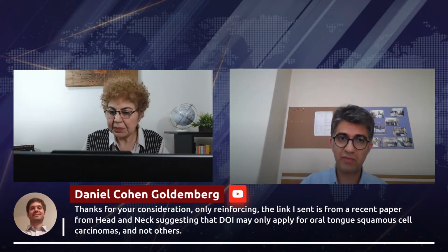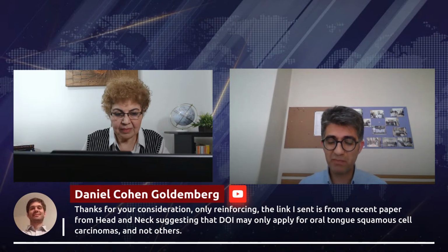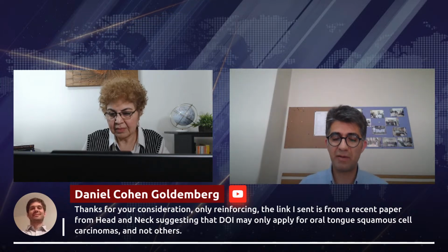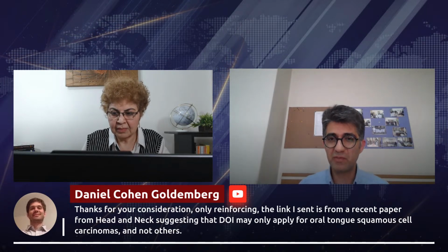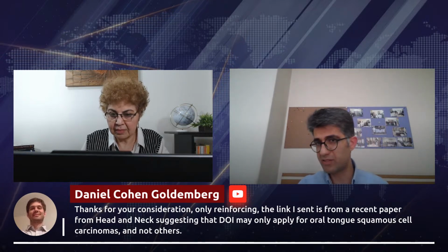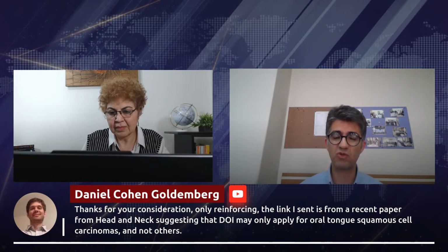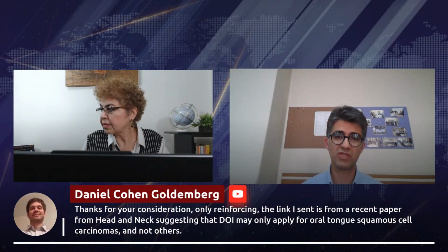I do agree with Dr. Daniel because, as I mentioned, the angulation of the specimen in different parts of the oral cavity may confuse the pathologist, and I can confirm your suggestion that it may be useful and helpful to assess depth of invasion in tongue squamous cell carcinoma.